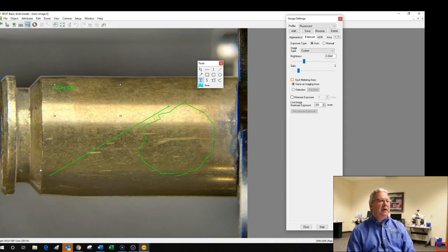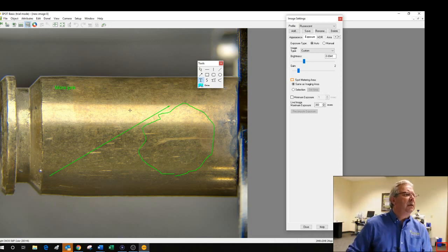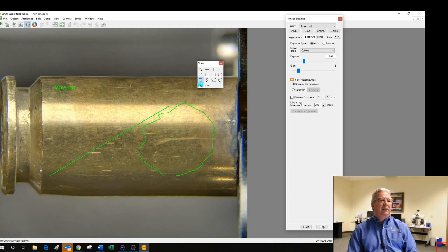So these other things that I've put on here are not burned in, and we can currently come back and modify them. The annotation that's active is defined by these little white boxes here. And somehow or another I clicked off them. Okay, well, I'm coming back to my toolbar. I'm getting a regular cursor back, so I'm not trying to draw anything. And I've now clicked on this free draw that I did here. So I know it's active. It's got those 4 little white boxes on it.